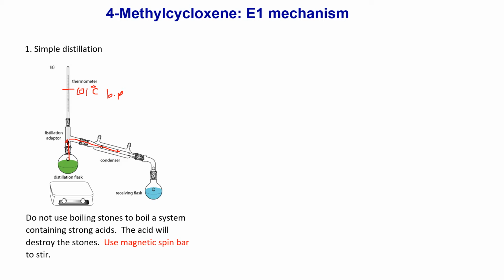Okay, so the condenser is made of what? Well, this is a water cooling condenser. So it's a piece of glassware connected to a water hose. Water will come in from here, water in. Make sure you connect the condenser to a water source. You will be provided with little orange hoses, and make sure you connect them to the bottom and to the top as well. With the water coming in from the bottom, it will travel up the condenser and out from the top. This is how you want to set it up. It's a water cooling condenser, so water out from the top, okay?